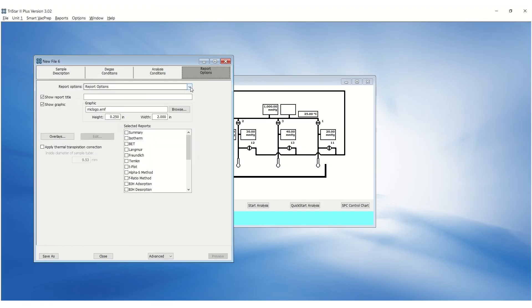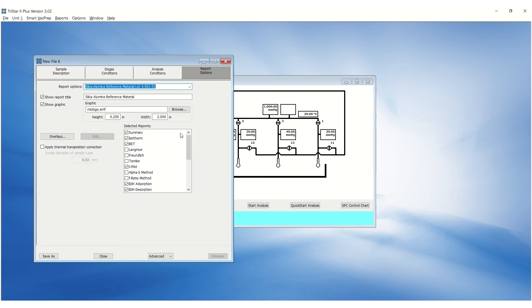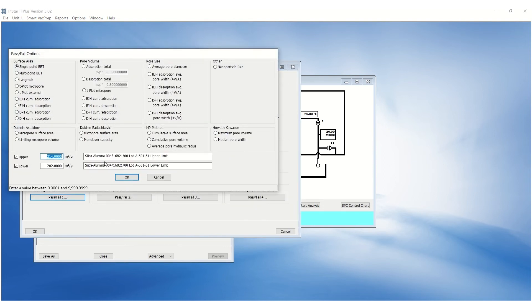Under Report Options, click on the drop-down menu and select Silica Alumina Reference Material. Select Summary and click on Edit. Select the Pass-Fail options. Update the upper and lower limits to the correct specification if needed. Ensure to enter the lot number for future reference.